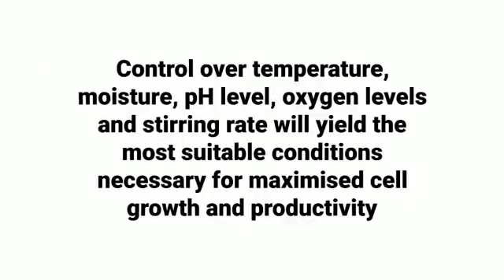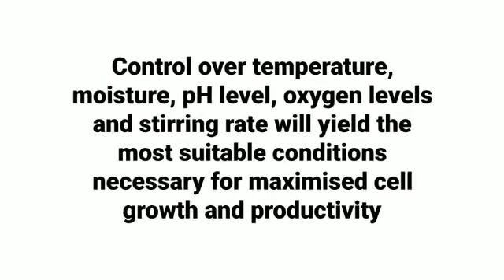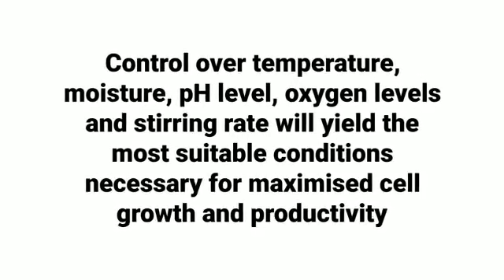They are sterile vessels with temperature controllers and gassing facilities required for starting a biochemical reaction. Control over temperature, moisture, pH level, oxygen level, and stirring rate will yield the most suitable condition necessary for maximized cell growth and productivity.